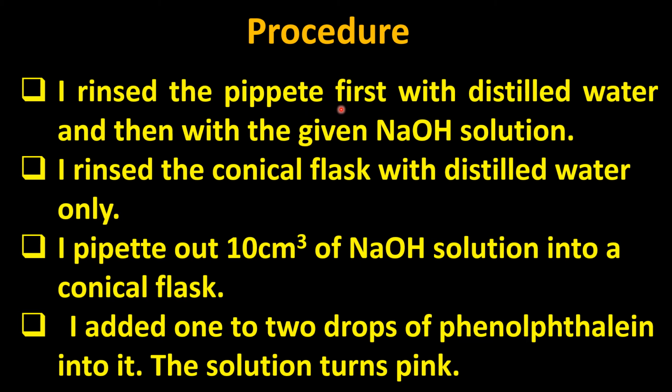Now what will be the experiment? The experiment will be so simple. You just have to discharge this dark pink color to light pink, and this shows that the reaction has been completed. So now let's move towards the procedure. We have to do all the steps one by one and very carefully.